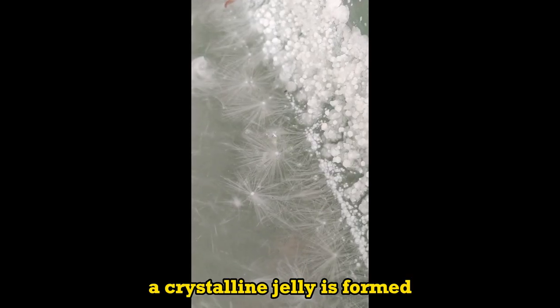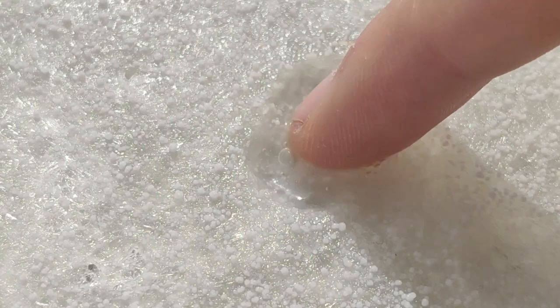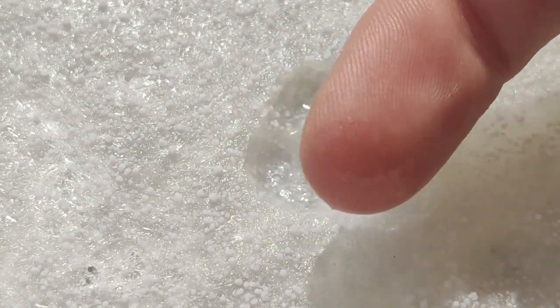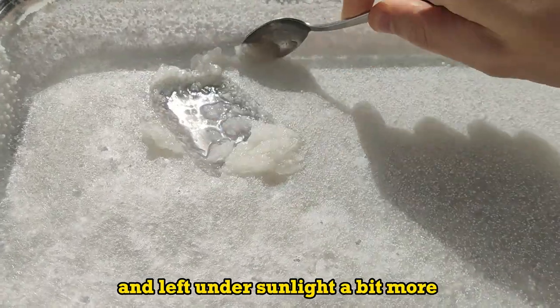A crystalline jelly is formed. With a spoon, the jelly is collected and left under sunlight a bit more.